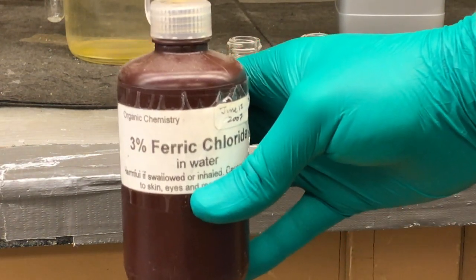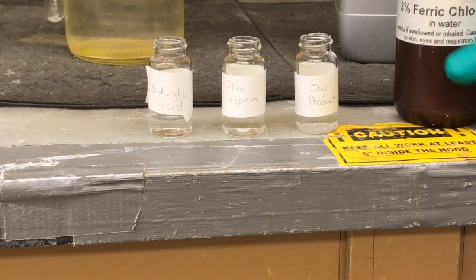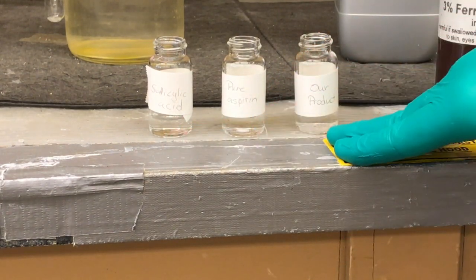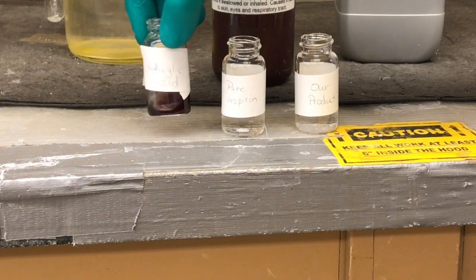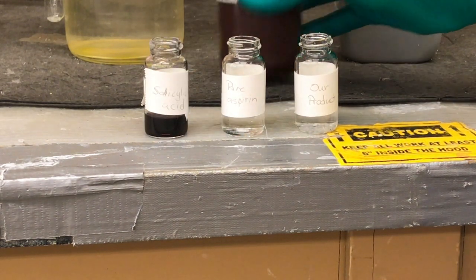So we're going to be adding ferric chloride. This is going to be to test for phenols. So remember, our starting material has the phenol that we then acylated with the acetic anhydride, so we should expect to see a color change for the starting material, but not for the pure aspirin or our product. If we add a drop, we see a nice color change for the salicylic acid.